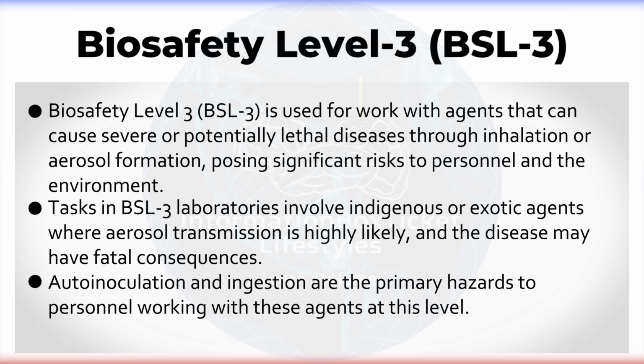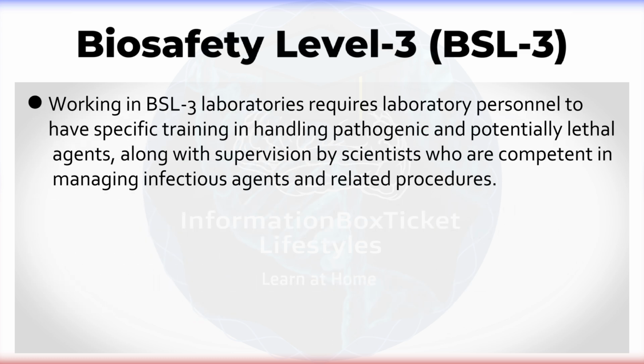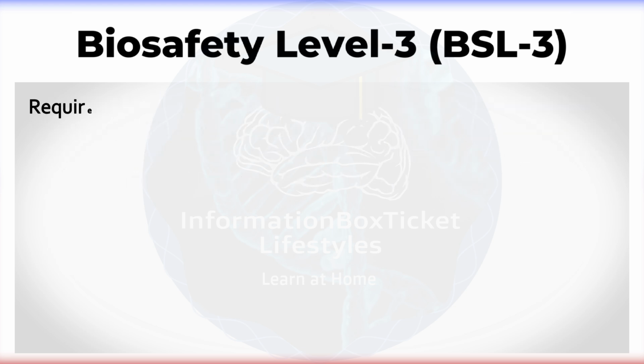Auto-inoculation and ingestion are the primary hazards to personnel working with these agents at this level. Working in BSL-3 laboratories requires laboratory personnel to have specific training in handling pathogenic and potentially lethal agents, along with supervision by scientists who are competent in managing infectious agents and related procedures.